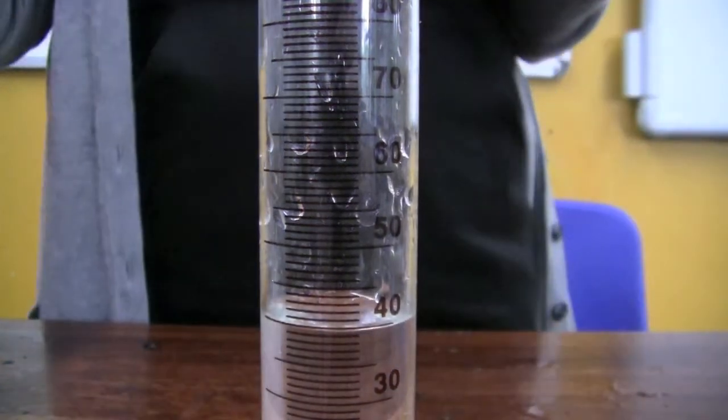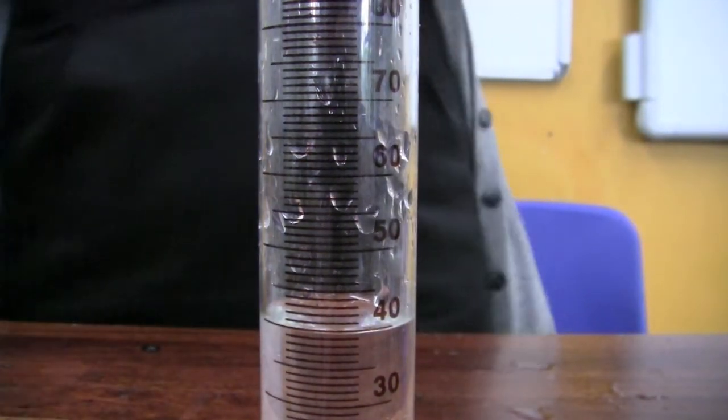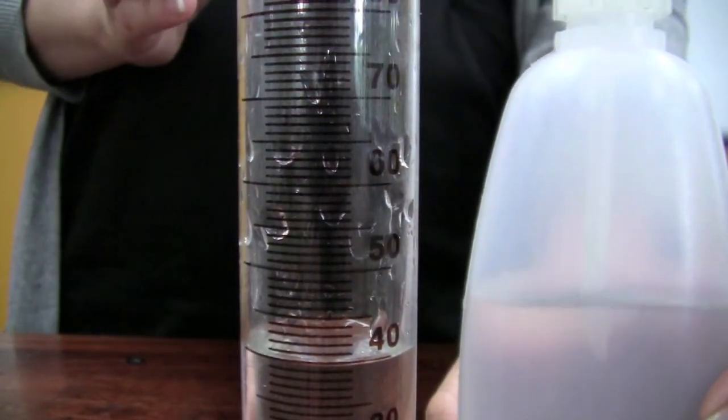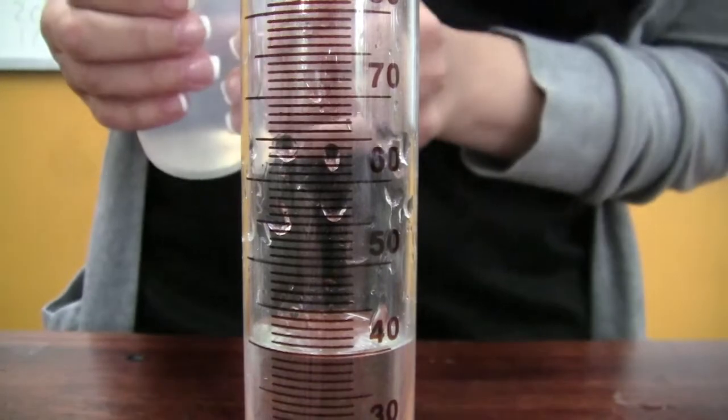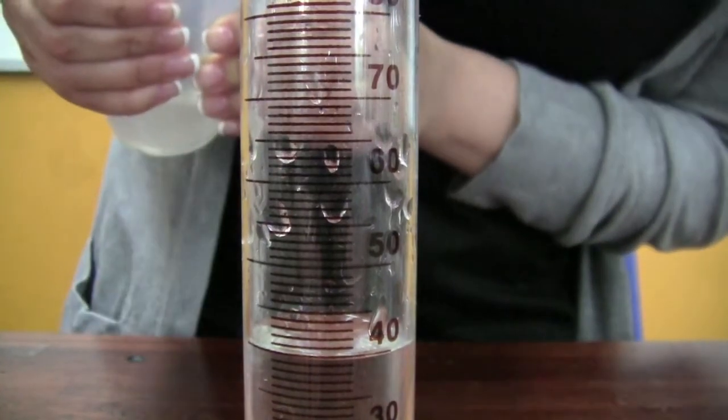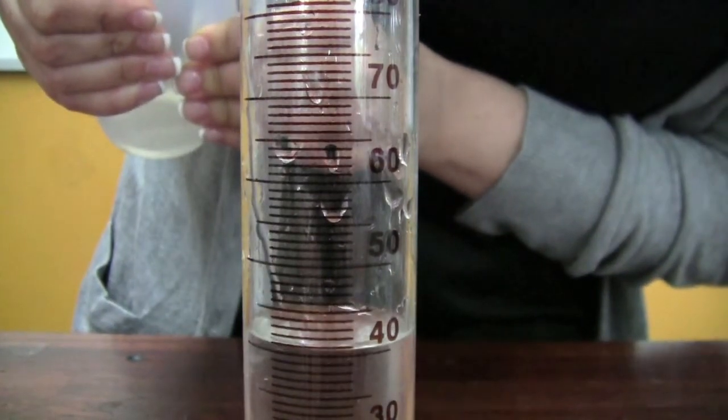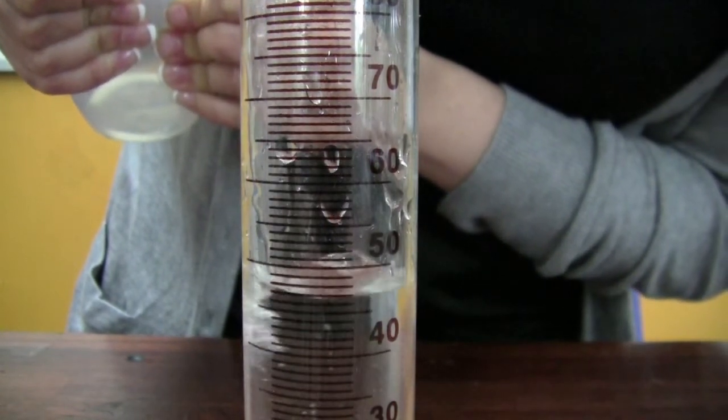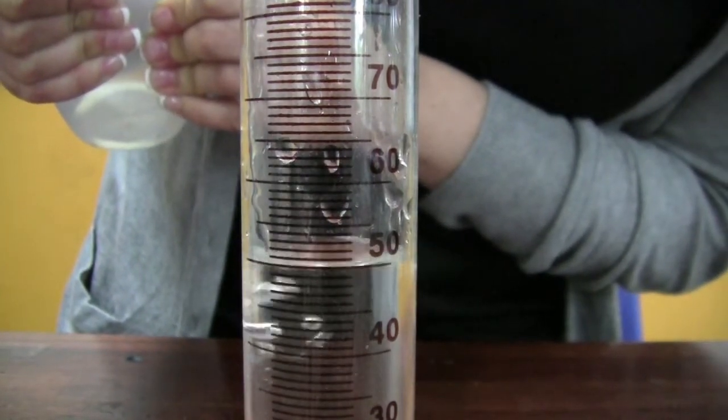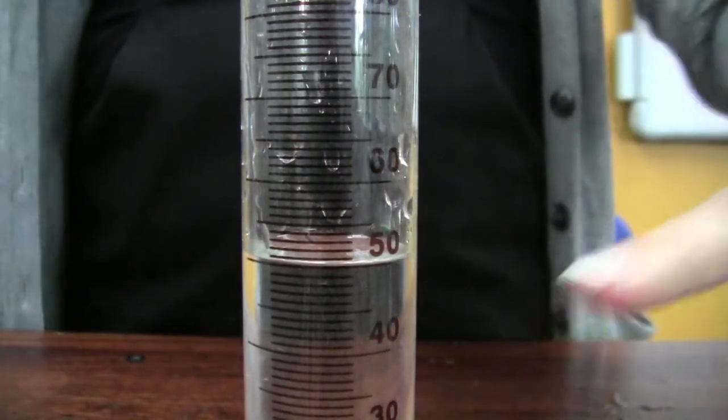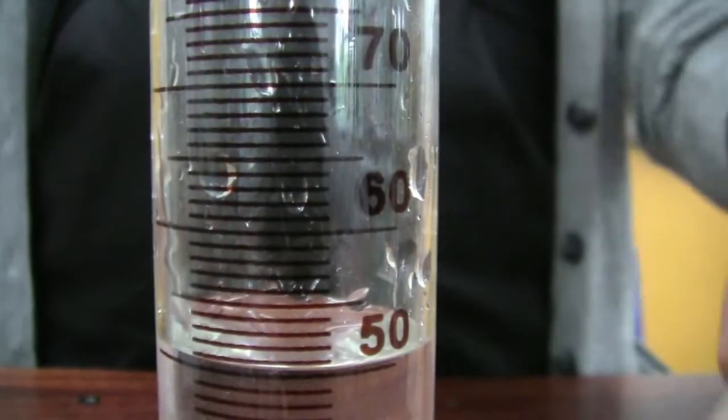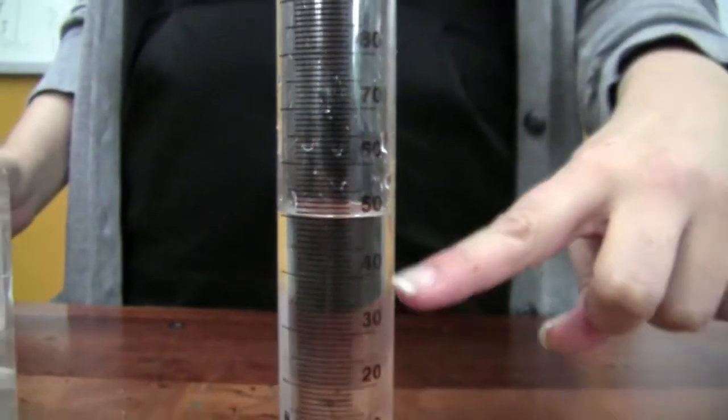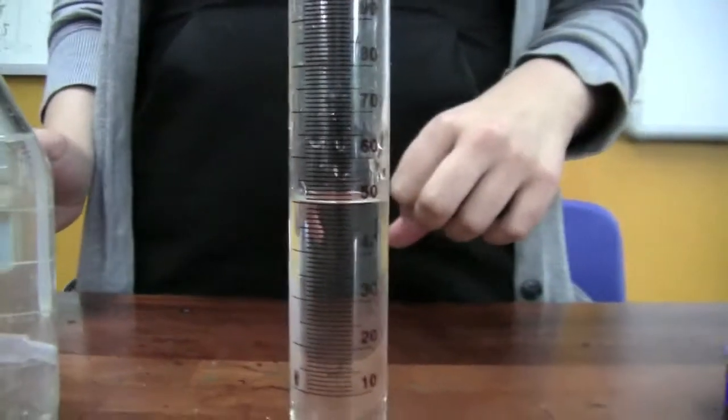Once the meniscus is at 40, we finish off with the water, the distilled water in the squeezy bottle, and fill it up to 50. Making sure that the meniscus is in the right place. So we've got 40 ml of sodium thiosulfate and 10 ml of water up to 50.